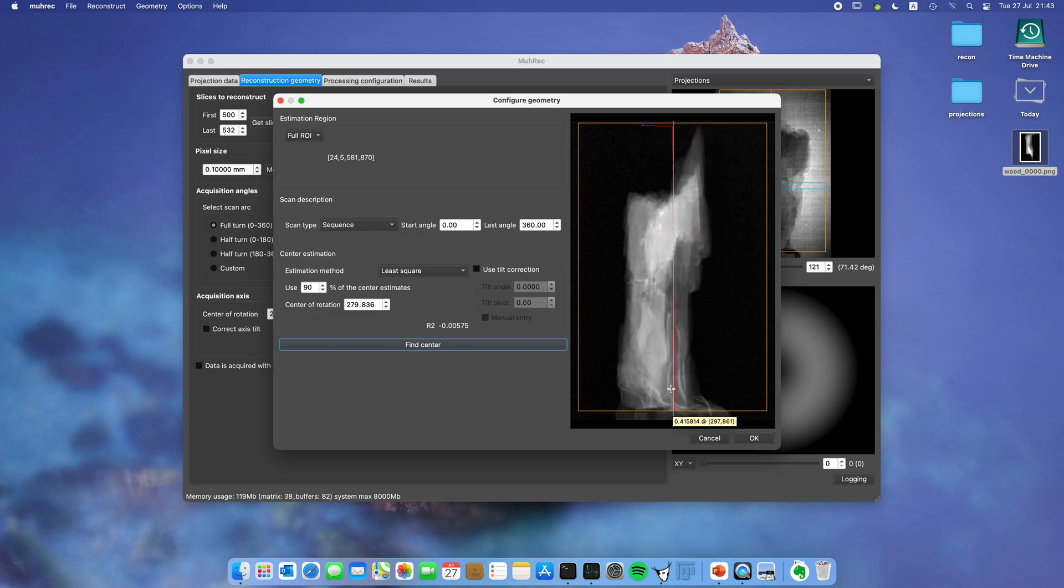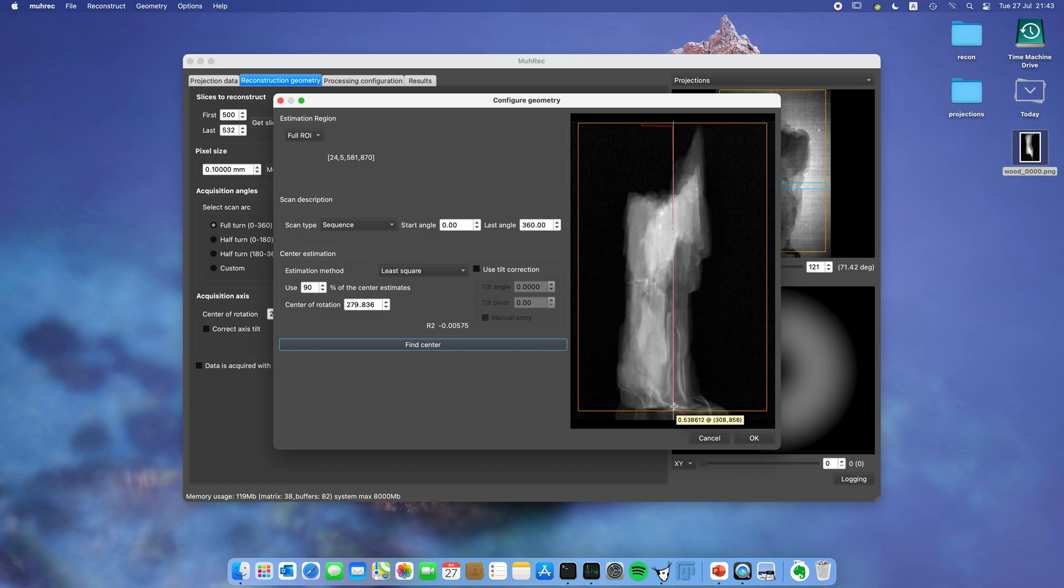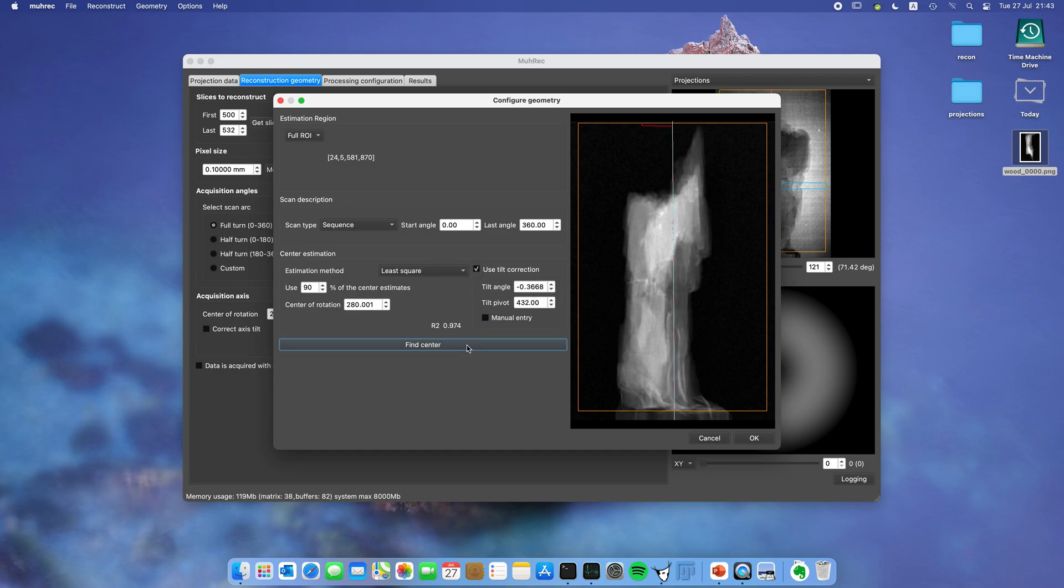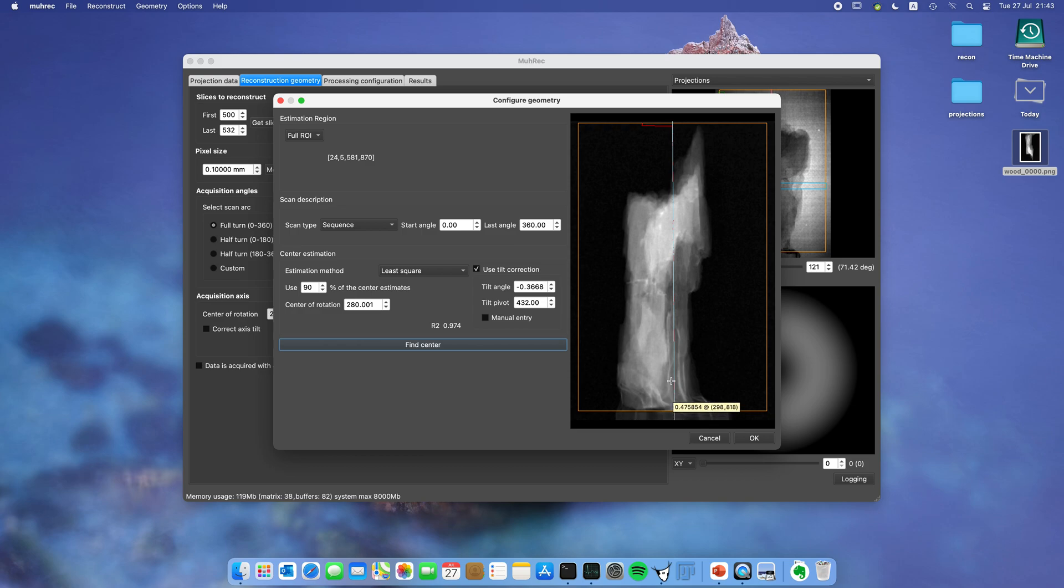But the problem is that the blue line here is a straight line, a perfect vertical line. You can see that there is a slight tilt. On this side you can see it's more red on that side, and up here it's more red on the other side. So for that we need to use tilt correction. If I click that one, find center, you can see that this line is now tilted and the fit is pretty good.